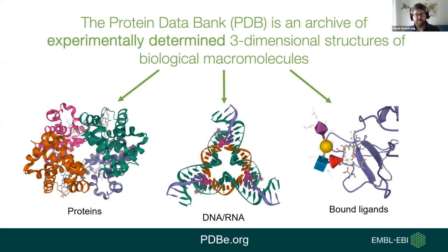Now, the other thing to note is that it's an archive of experimentally determined structures. Now, the benefit of this is that you have experimental data to validate the structures against. So as well as validating on the model and the geometric plausibility of the structure, you have experimental validation to know how much you can rely on that data.